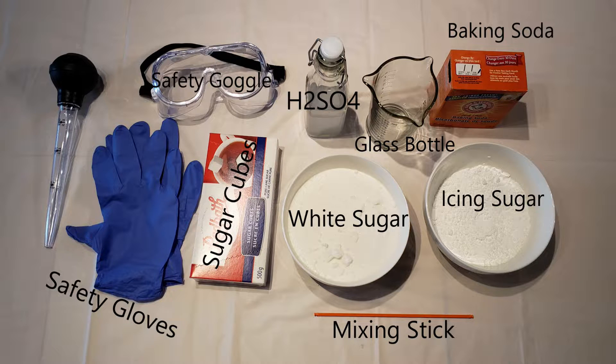Then you will need sugar. We have three types of sugar because we are doing three types of experiments. Then you will need a glass bottle. This is to contain the experiment.